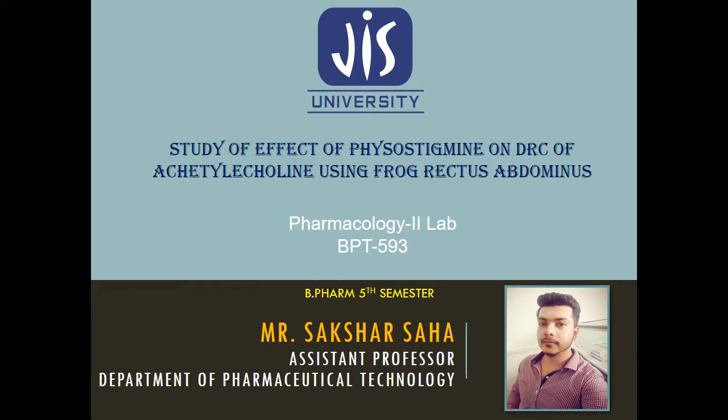The topic I'm going to talk about is Pharmacology-II lab. The topic is of B.Pharm 5th semester, and the subject code is BPT 593. The topic I'm going to discuss today is study of effect of physostigmine on DRC of acetylcholine using frog rectus abdominis. So this is the topic I'm going to discuss.